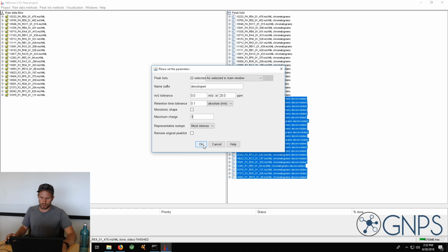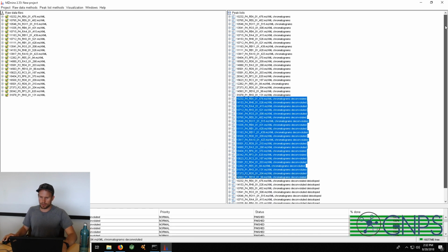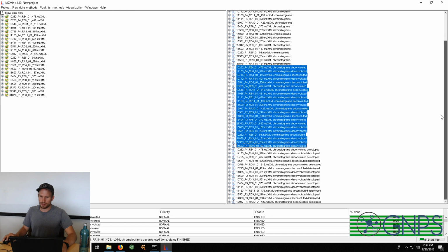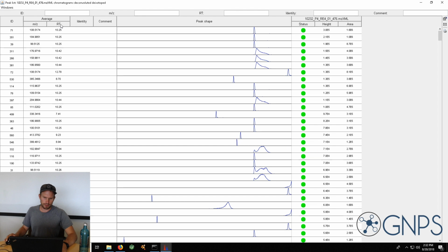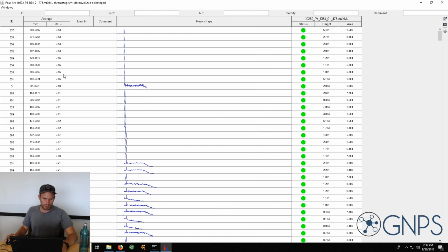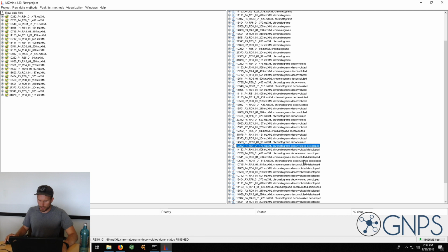And then I just hit OK. Now a new set of peak lists should appear. When we open one and sort again by retention time, we should not have this increase of 1 m/z as we go through. And if you look at some of the examples, it actually looks good, and we can proceed from here.